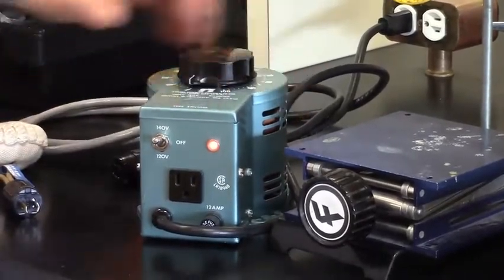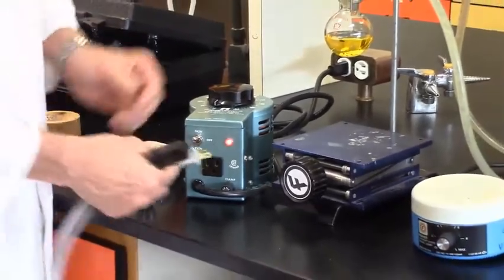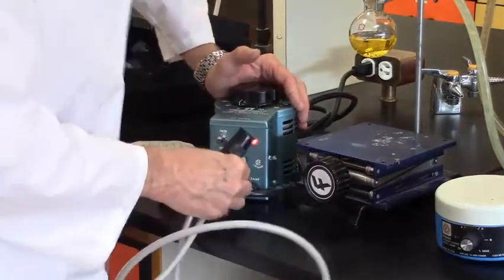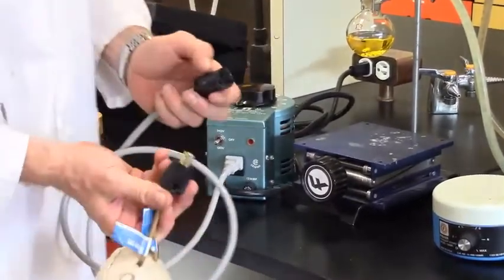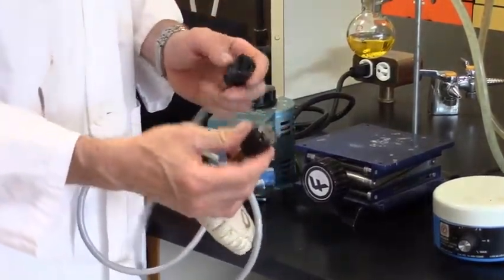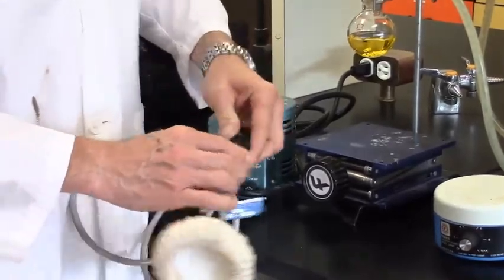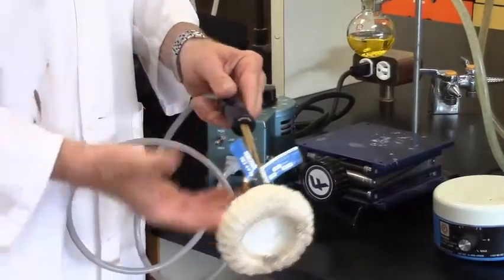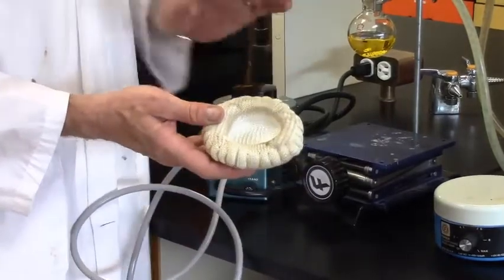Now we need to get the electricity from the variac into the heating mantle, and we need a heating mantle cord. It plugs in and it's polar, so you have to make sure it's oriented properly. These plug-ins are a little different — you may not have come across these before. When they insert, they only insert in one fashion, and to make connection you actually have to rotate it. Once it rotates, it has connection. If you simply plug it in without rotating, there won't be a connection and turning the variac on will have no effect.